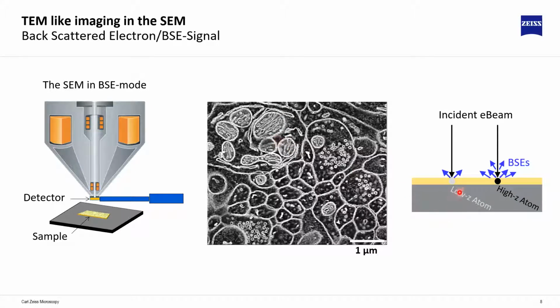Other areas which generate less signal are reflected here in dark. So in the cytosol area, et cetera, there are not many heavy metals in the sample, which eventually generates a low signal. And that's how we make up the image.